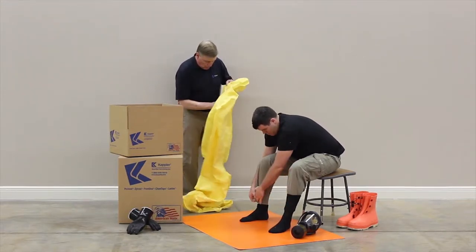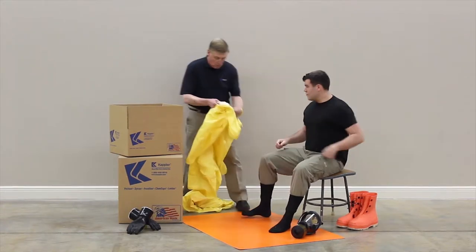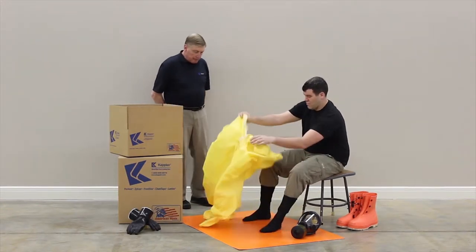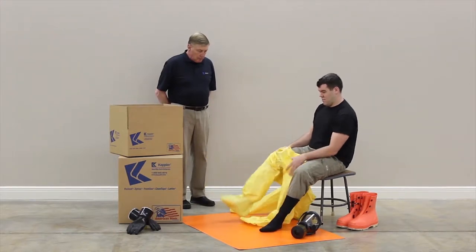Open the garment zipper completely. Both the wearer and the assistant should confirm the garment is the correct size. While seated, insert feet into the garment legs and down into the sock boots.